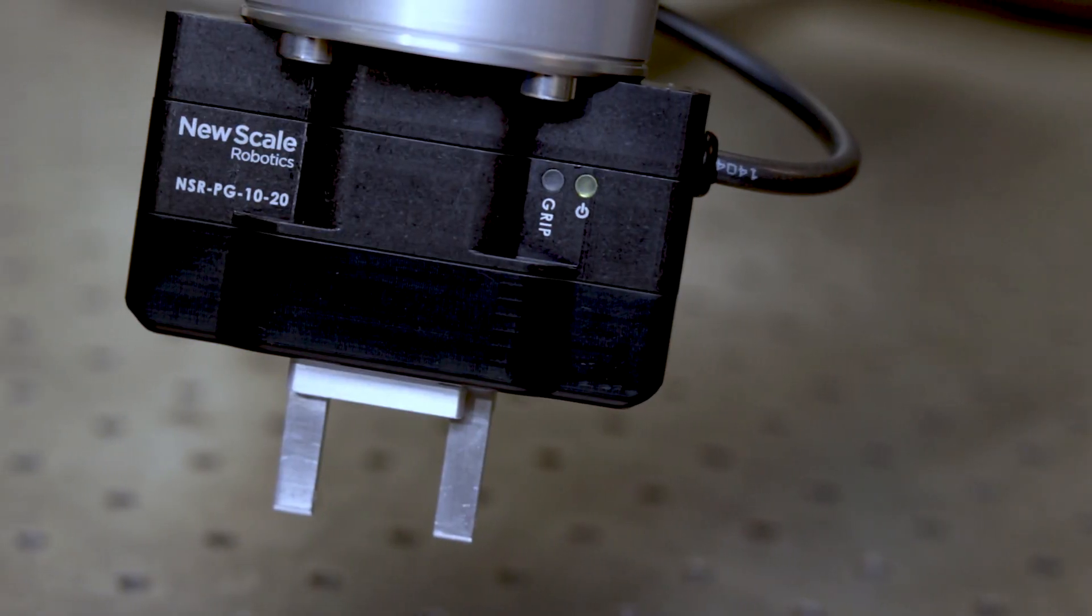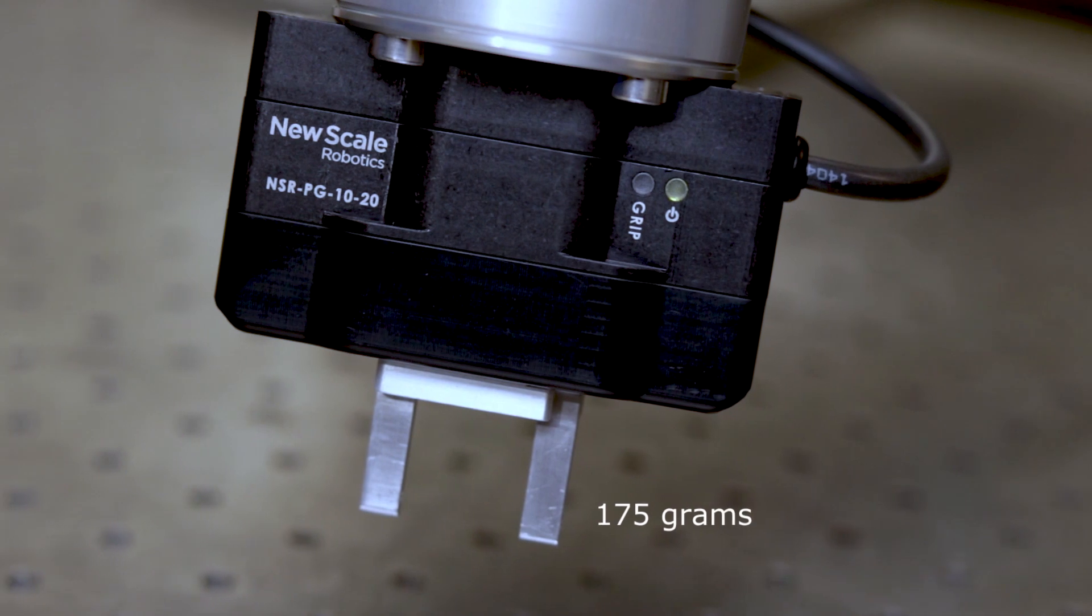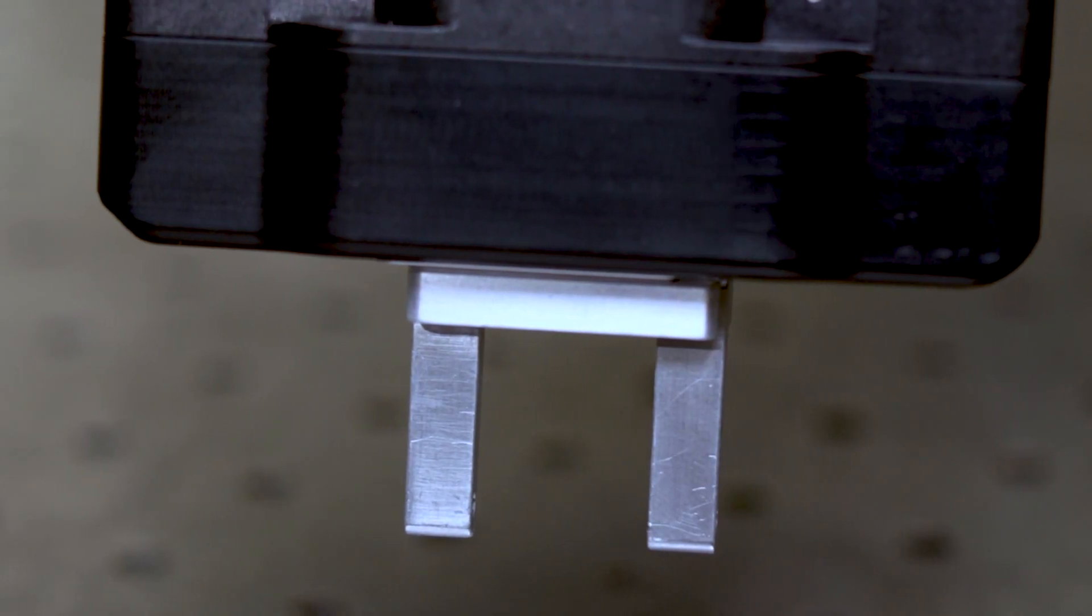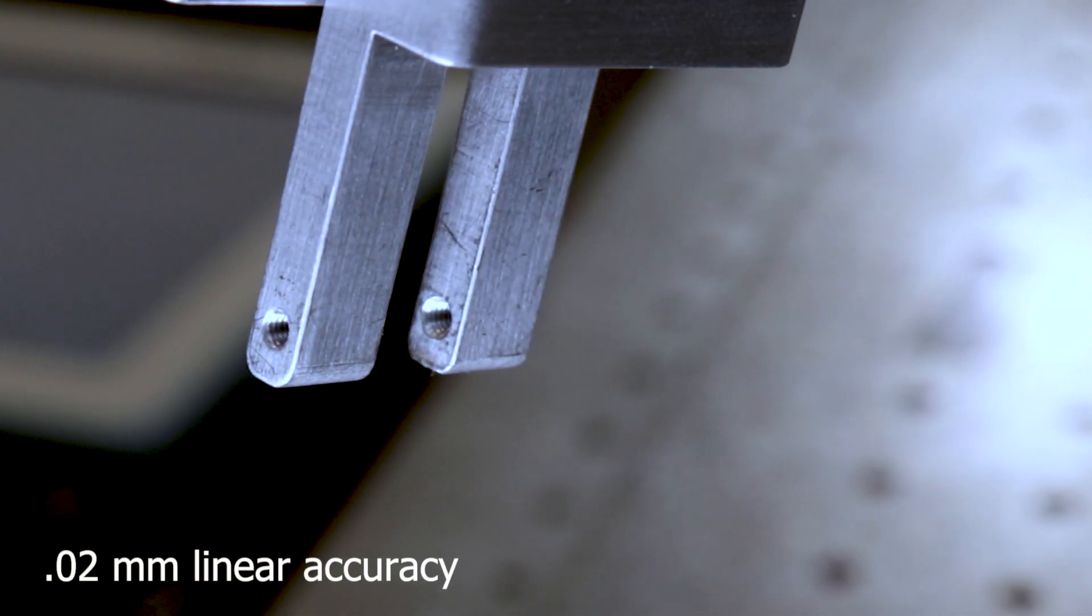We have used this experience to develop a smart parallel gripper weighing only 175 grams and moving with a linear accuracy of .02 mm over a range of 20 mm.